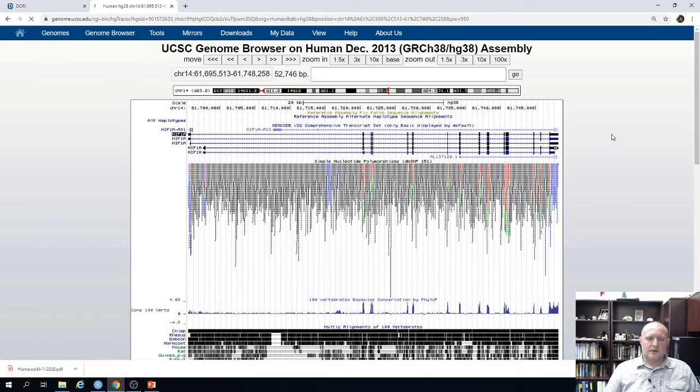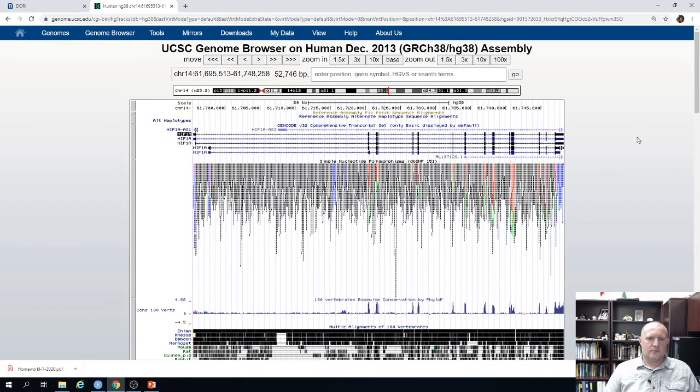Now, what the Ucsc Browser is, it's an excellent way of portraying different data and information on the genome that you're looking at and superimposing it on the chromosomal region that you have in the viewer. And so basically all the pieces of information or the data sets, or databases, that are being projected on the chromosome are represented and visualized in tracks. So I've highlighted the GENCODE track for the gene annotation of the human genome assembly, okay?